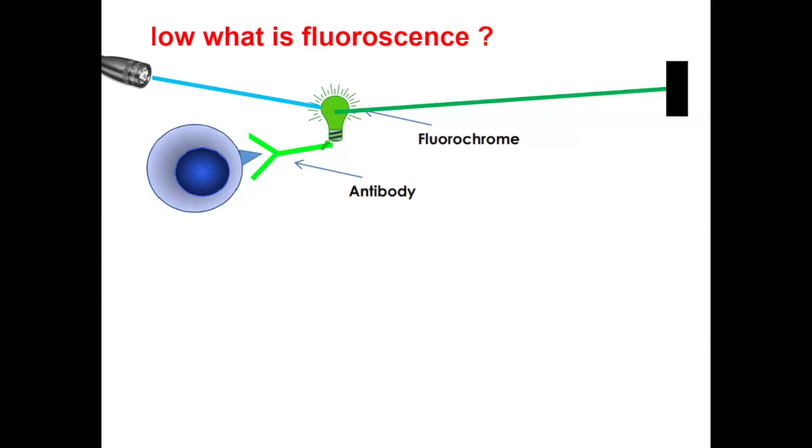So that's how a flow cytometer, apart from capturing data from the physical properties, that is forward scatter and side scatter, also captures data about the antigens and proteins present in the cell to diversify the populations which are similar by physical appearance. Beauty, right? Certain things we find difficult to understand, but you think about the person who discovered it. Hats off. So that's how the flow works.